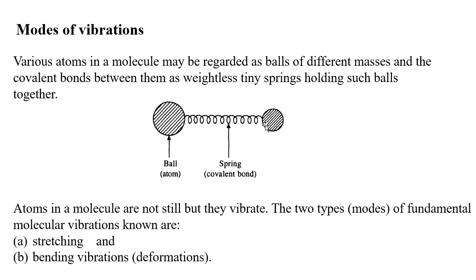You can see these are two atoms held by a weightless spring, and this spring can be considered as the covalent bond which connects these two atoms within the molecule. Also, you know, atoms in a molecule are not still, but they vibrate.